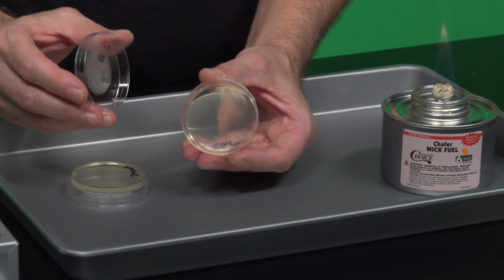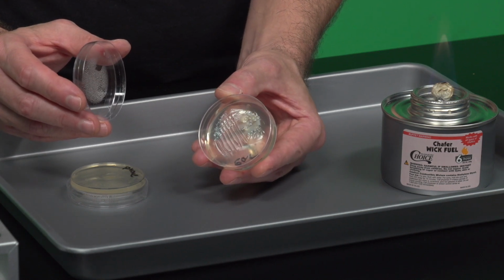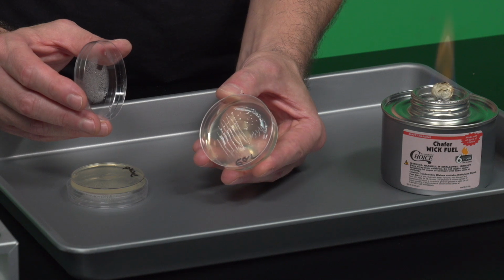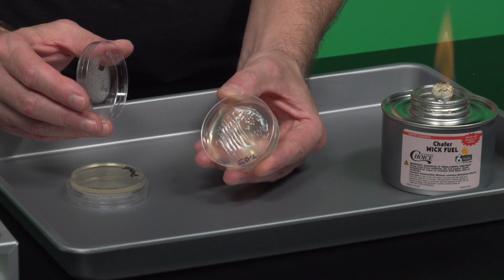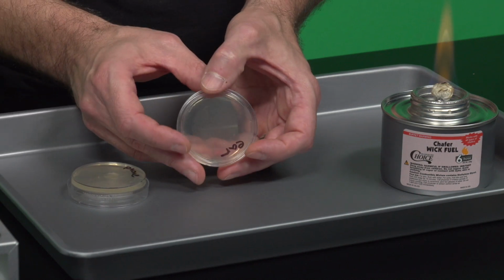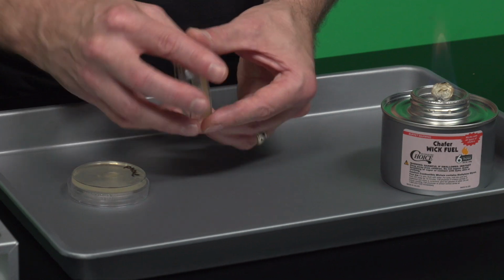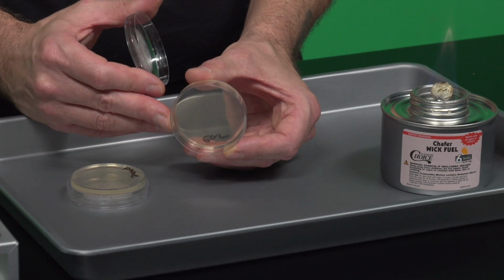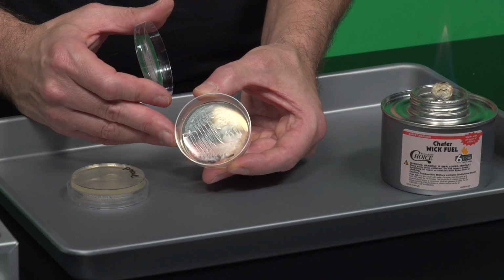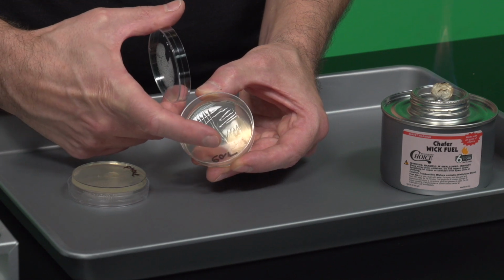And what you can see from this is essentially the different streak marks. Okay, so it is a little bit hard to see, but you can at least see them carved out. And I wonder if it'll be a little easier this way. That sure is flashing, isn't it? There we go. Okay, so from quadrant 1 down here, right?